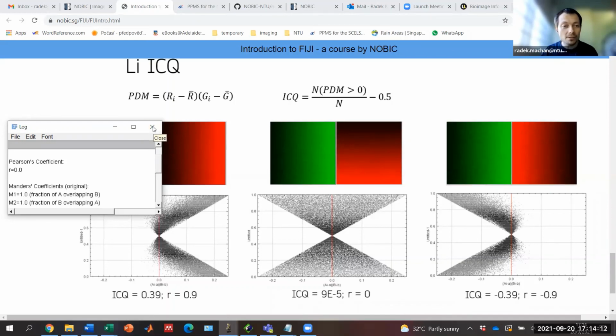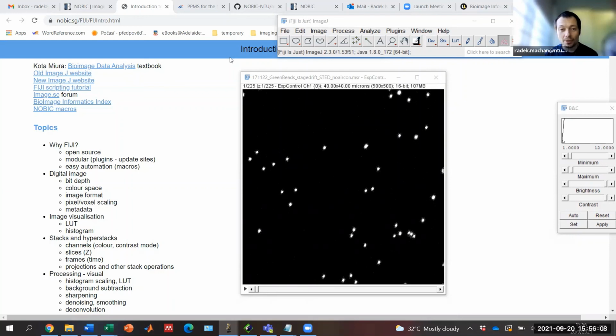If you have any questions, is there a way to revert to a previous version of Fiji? Not an easy way, unless you have a backup. So maybe it was my mistake. I should have made a backup, copied my Fiji folder before I did all these updates, and then I could run Fiji from the backed up folder. I haven't done it. I didn't suspect it would go this wrong, considering that I've updated quite recently before.